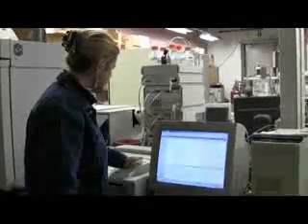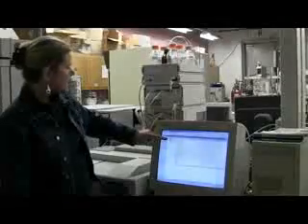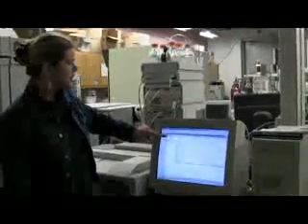So, all right, here's what we're going to do. The instrument is on, the computer's ready. So what we're going to do is we're going to click here on methods. There's a little plus sign next to the methods. We're going to click that plus sign. And then we'll find here example methods. All right, let's go here. This is the Lambda 25/35/45, so we'll click on that folder. And we will get different example methods. So you can see there's different choices here.